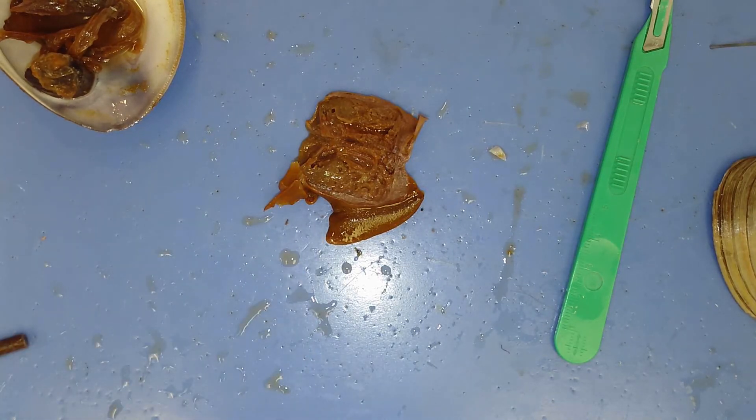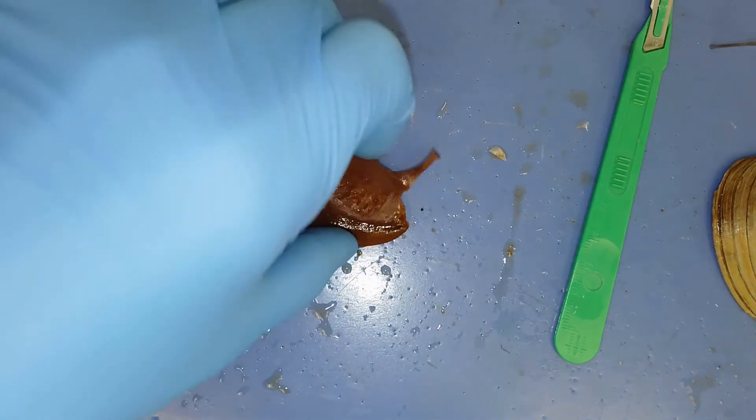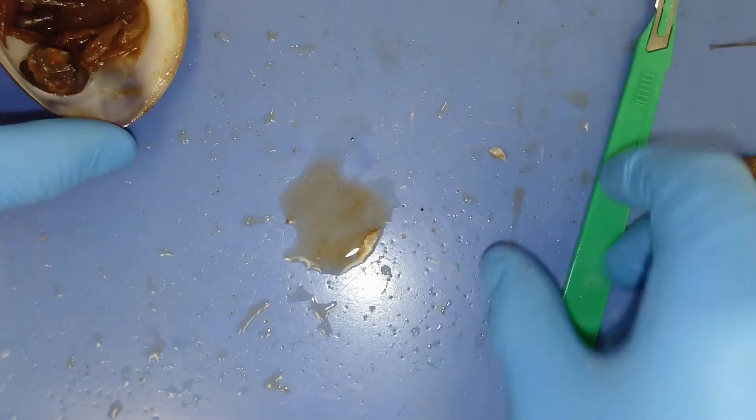Everything in the class or the phylum Mollusca will have four things: a visceral mass, a foot, gills, and a mantle. I'm going to grab my favorite specimen and show each of the structures on a separate, fairly distinct organism.